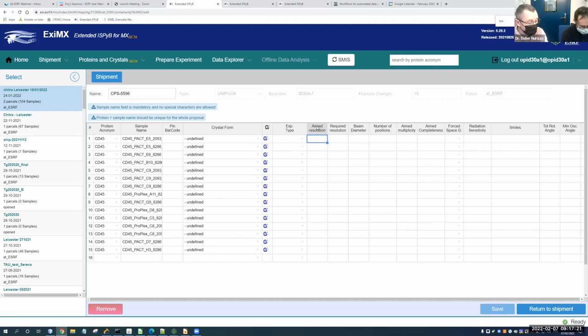I'd just like to say as well that it's actually only for the mesh scans that it would be placed here. So for characterization, we already do a pre-calculation of resolution. So we would start higher if you say higher, but if you don't put anything, we already move it higher or lower if it's better. So it's already pretty good actually if you don't put a value.